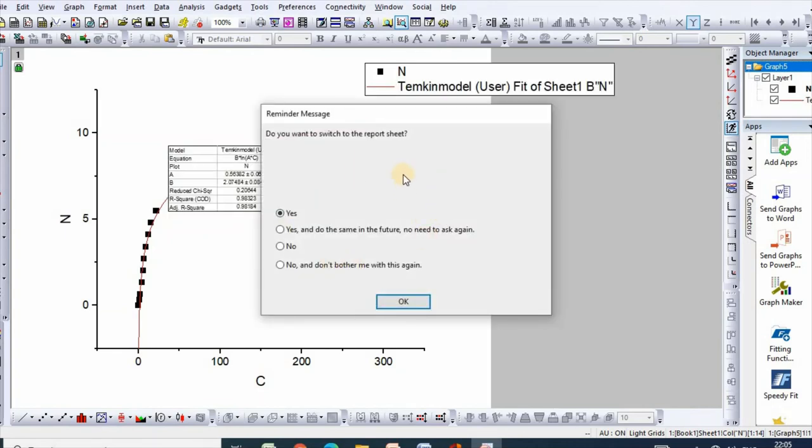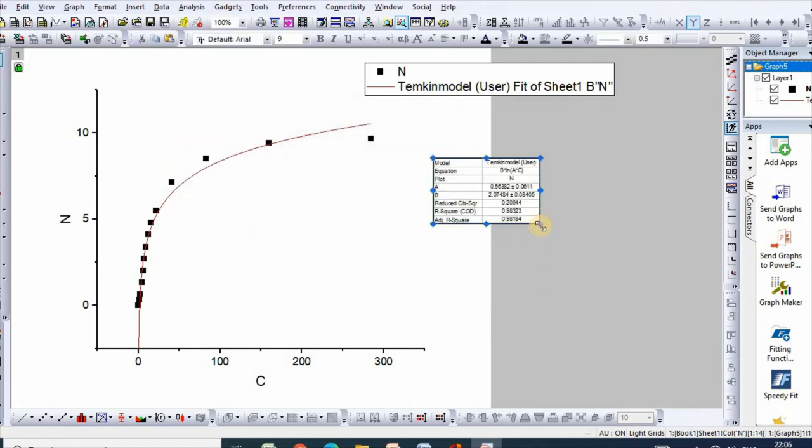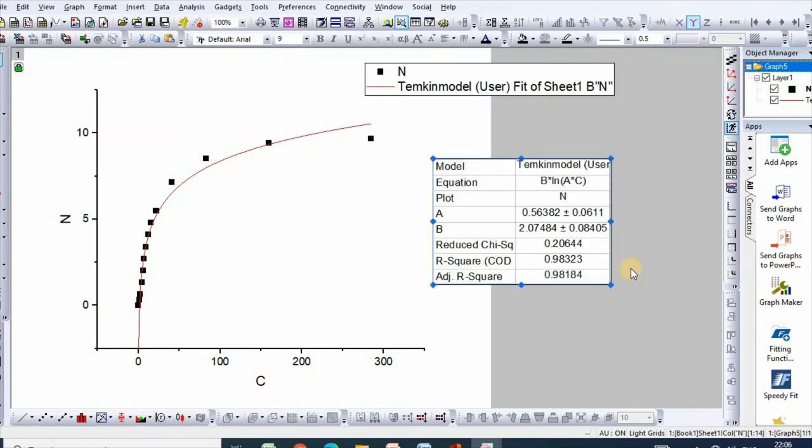If you click yes, then the report sheet will be displayed here. If you click no, then OK. Here are your parameters A and B, and R-square value is this.